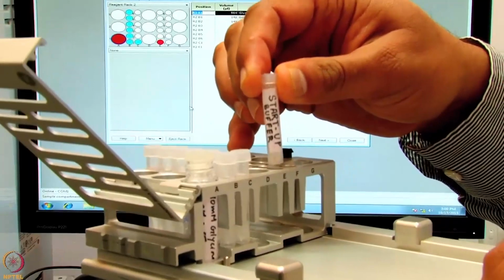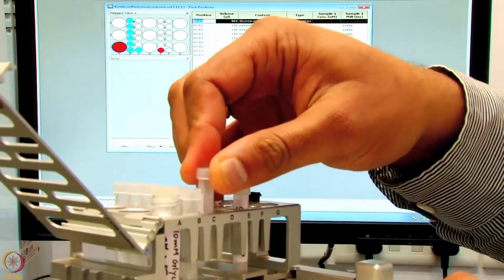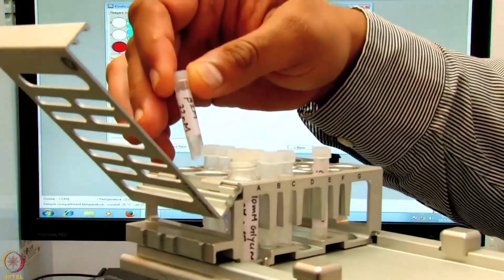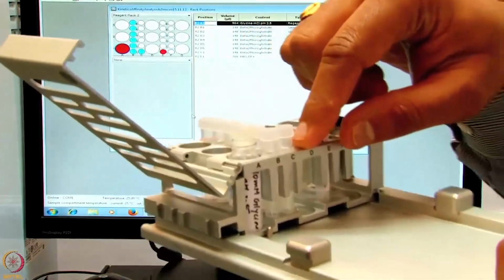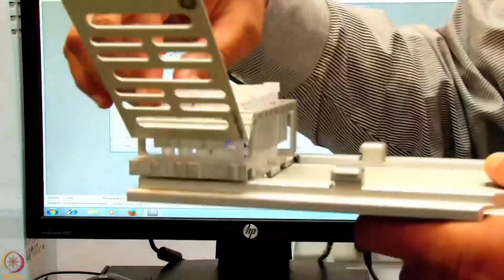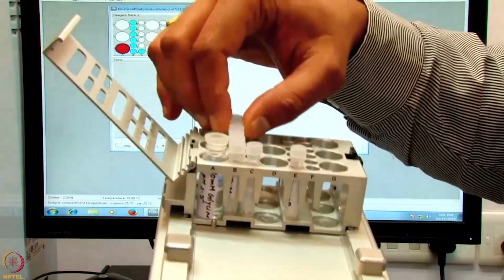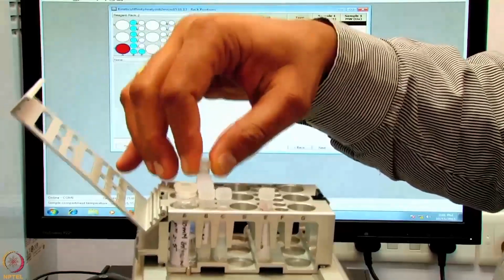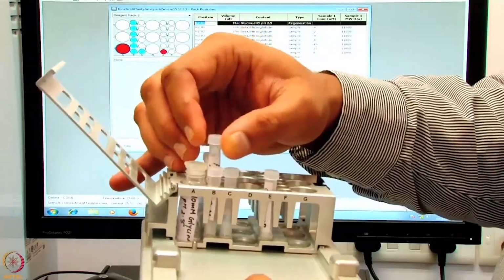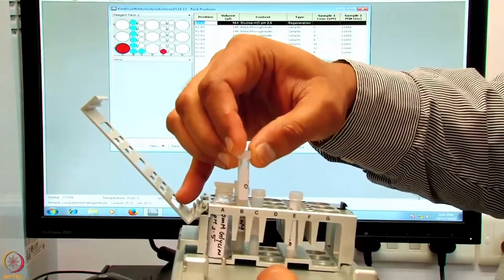To start with, we have startup placed at E1 position, and we have the different concentrations of beta-2 microglobulin with the concentration marked from positions at C1, B1 to B6, so 32, 16, 8, 4, 2 nanomolar, and again 0.